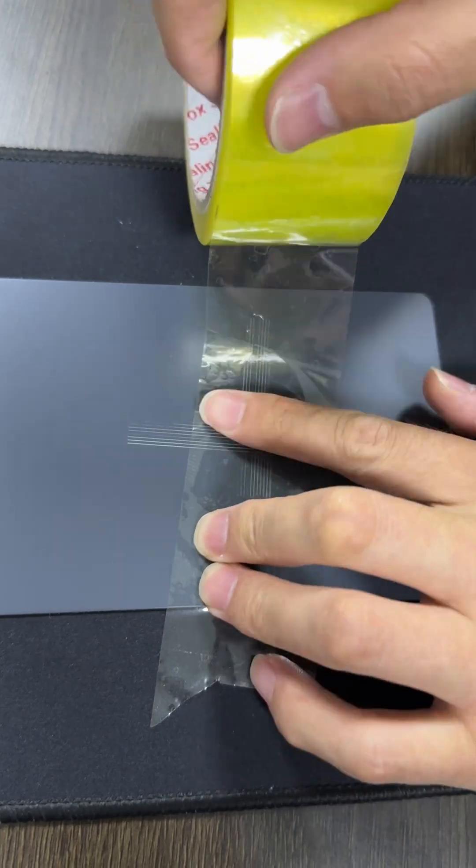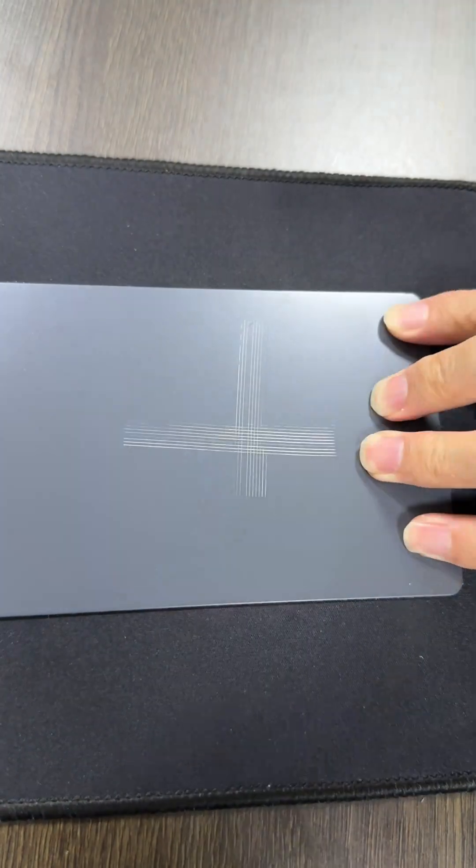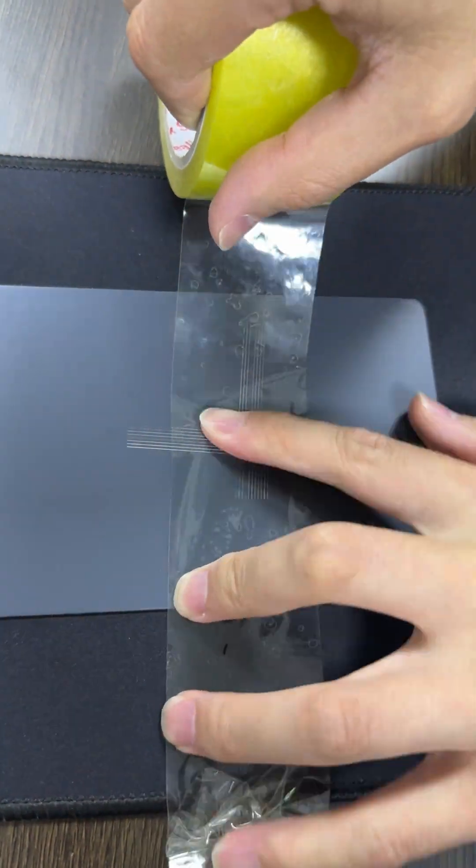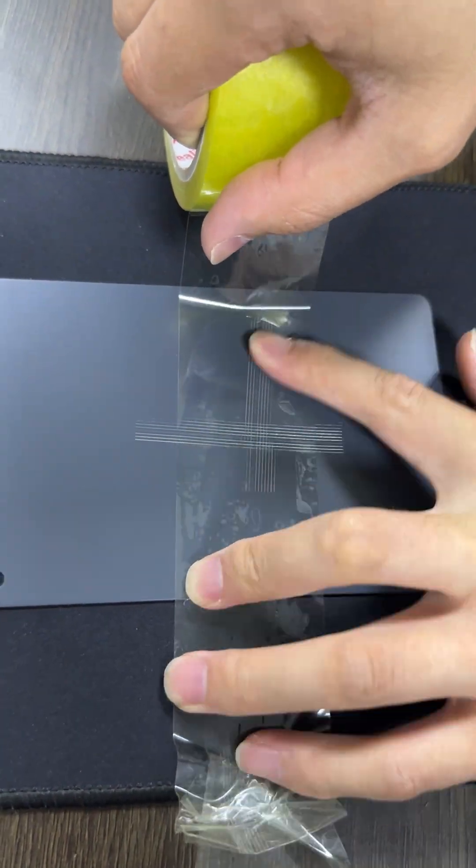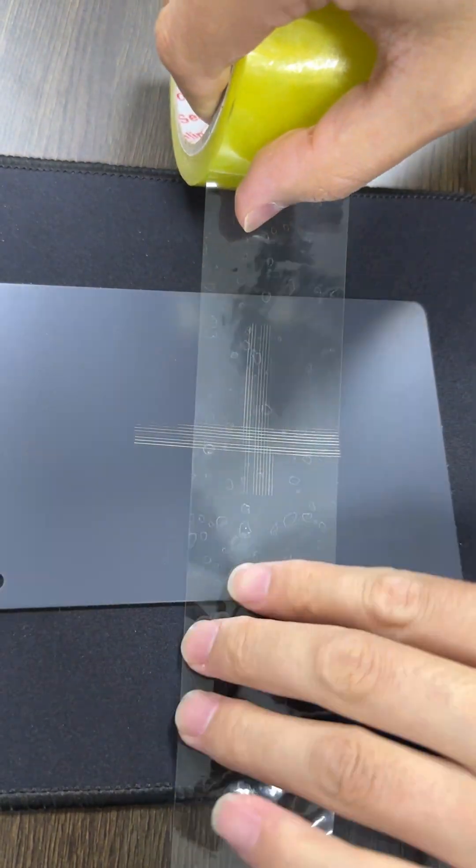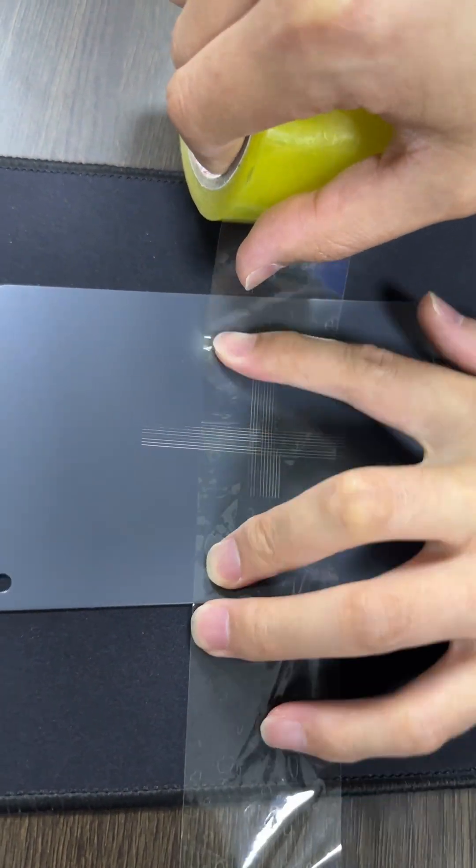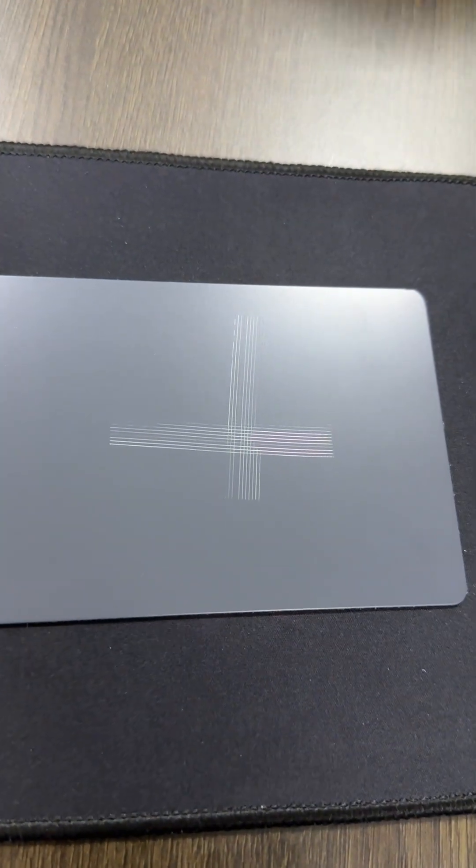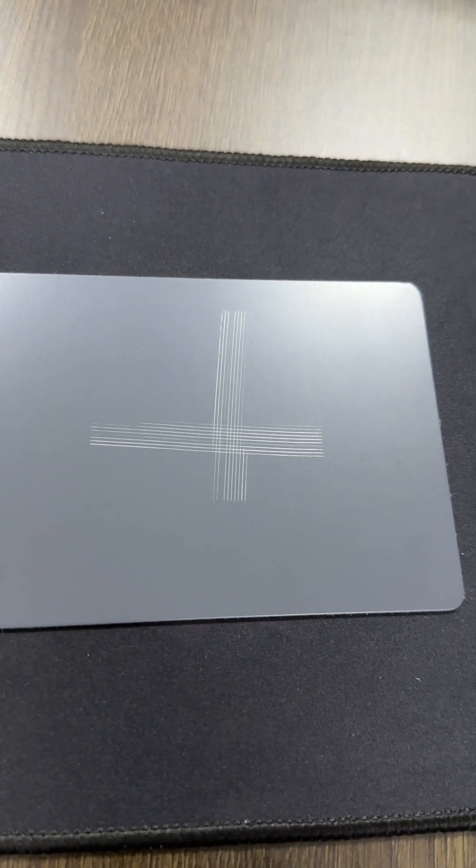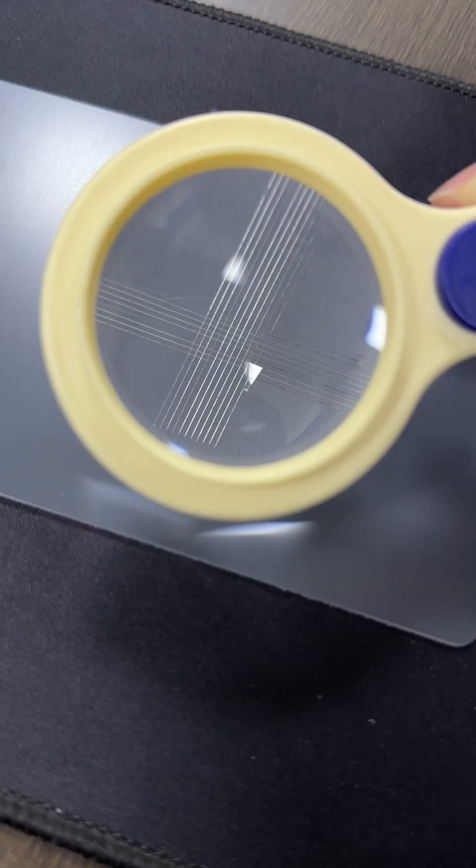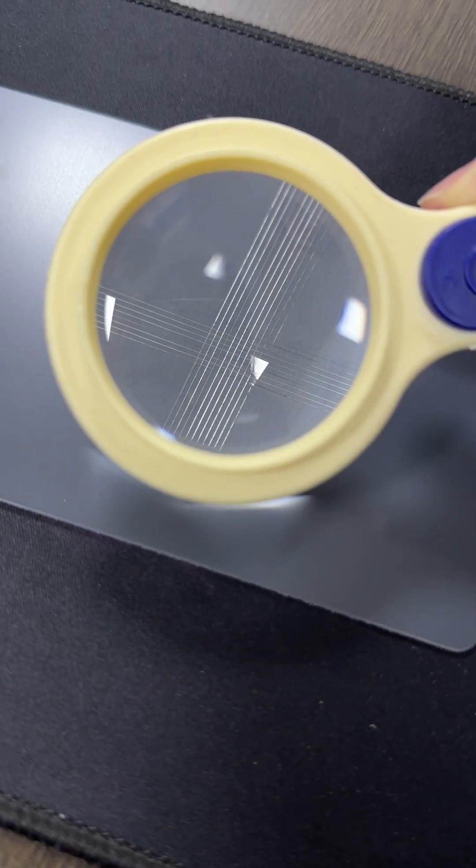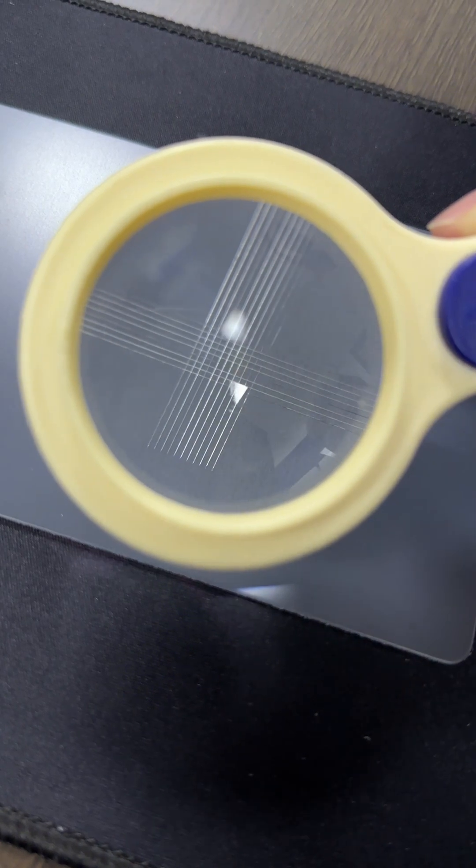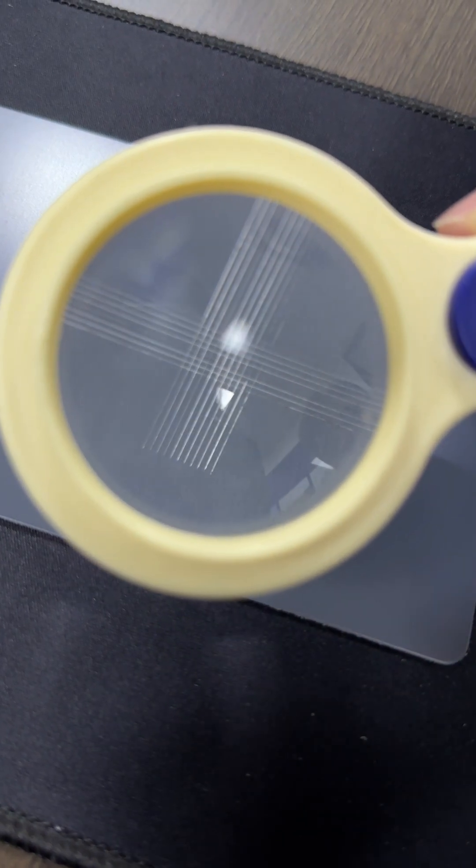Then we use tape to determine the adhesion properties. Now we are going to apply the tape, press it down onto the sample, and then pull it at a constant rate. Then we look at the sample to determine how many squares were removed and what the rating will be based on ASTM D3359.